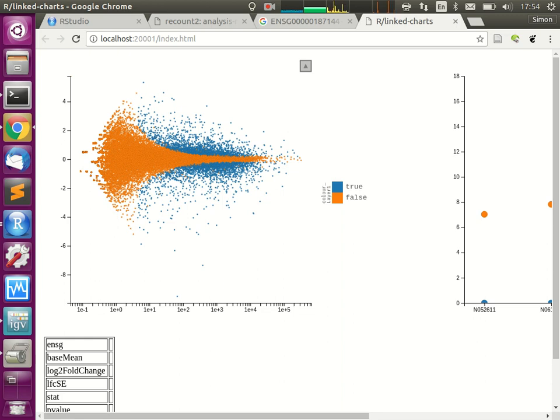In biology, at least for a cell where everything is interconnected, this doesn't make sense. So if you ask me how many genes are differentially expressed, I ask you, what do you mean by differentially expressed? And you might say, well, that its expression changes under treatment. Then I can give you an exact answer, which is always true, and it's all genes. Every single gene is always differentially expressed if you do something. What you really want to know is which genes are strongly differentially expressed, and what you also might want to know is, do they go up or down?